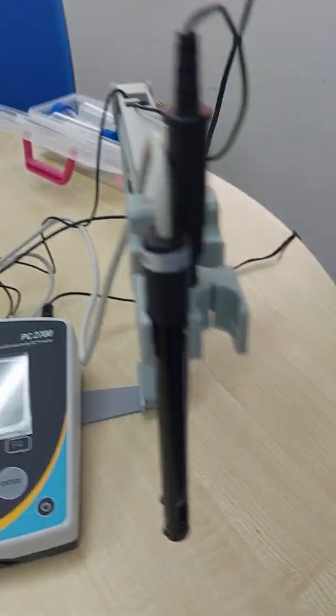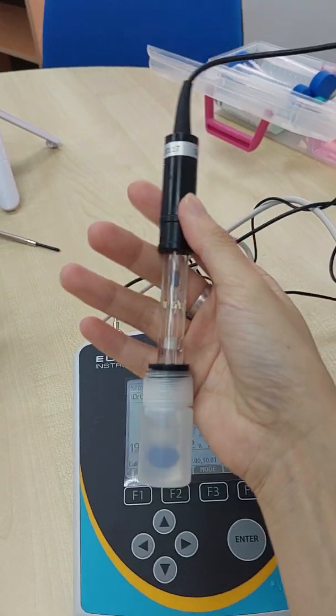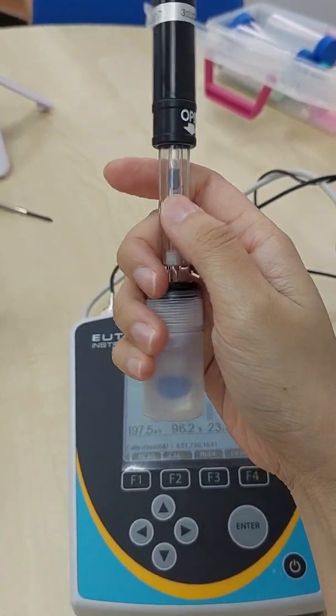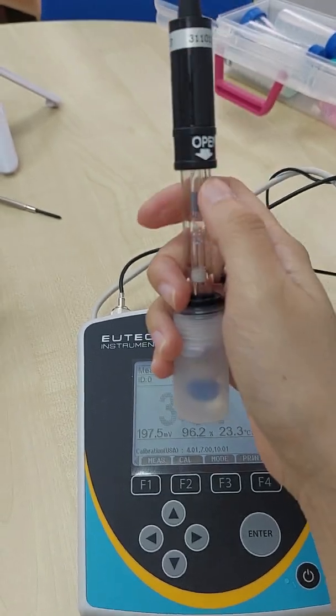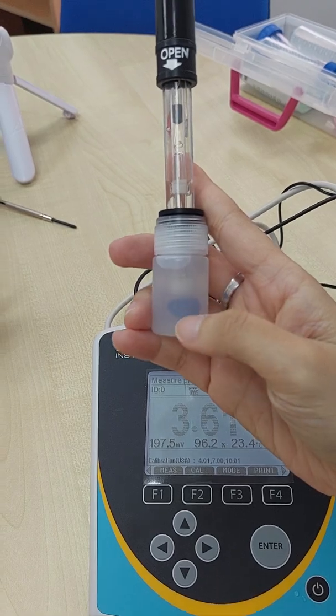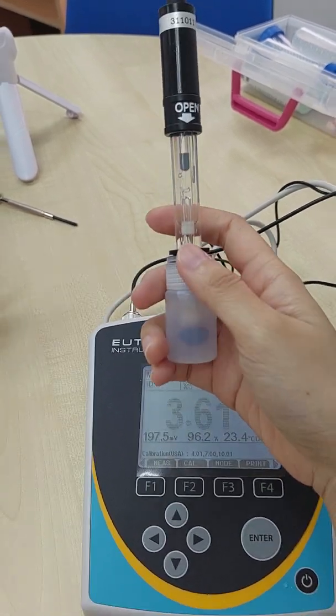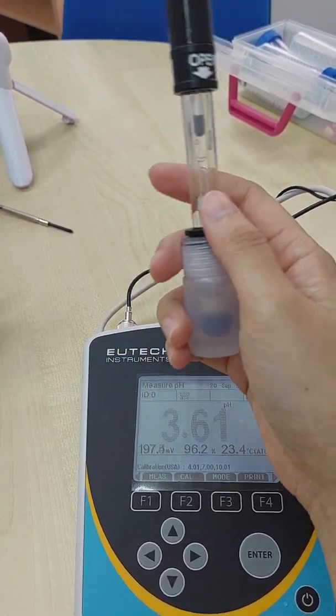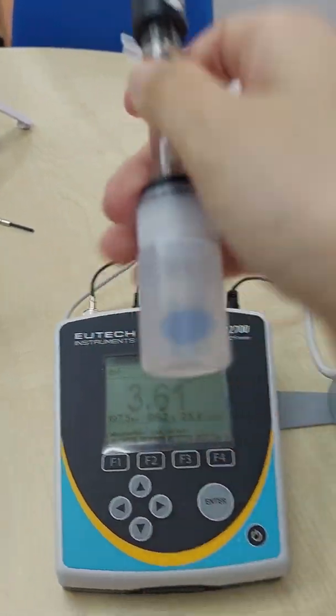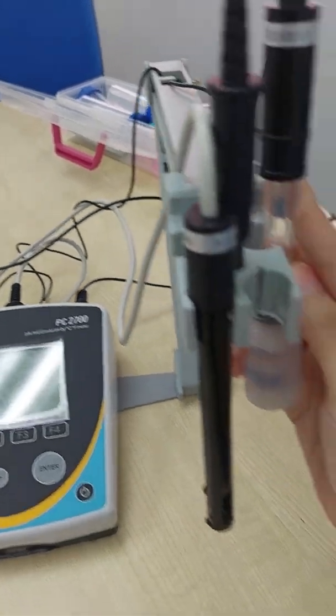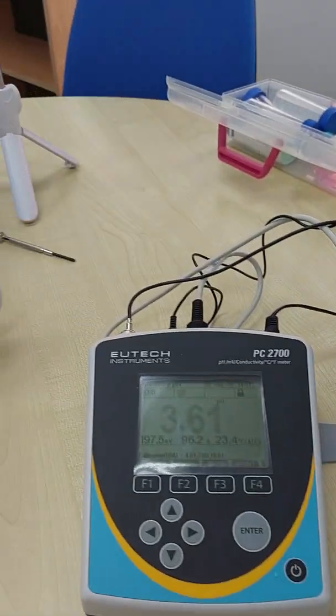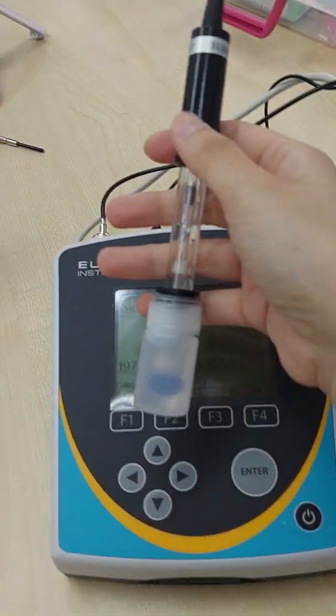So this pH electrode, as I mentioned earlier, is double junction refillable. You will need to make sure the electrolyte inside is up to the hole level, and then always store your electrode in KCL solution. Never store in distilled water or any pH buffer, only KCL solution. And then every day before measurement, we will need to perform pH calibration and then always rinse with distilled water for each measurement.